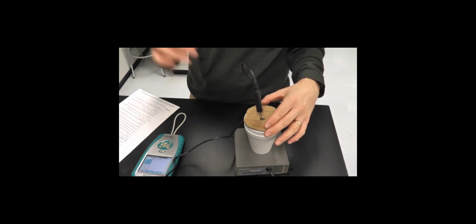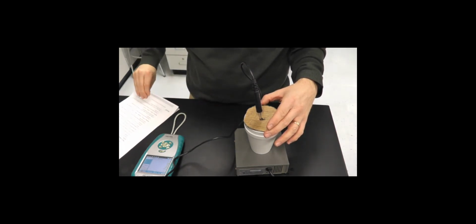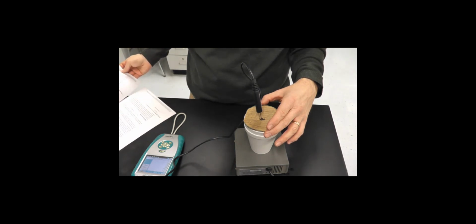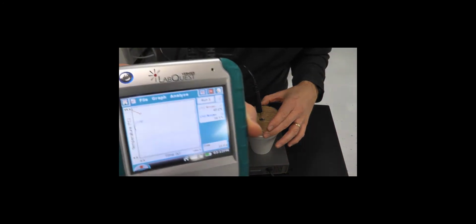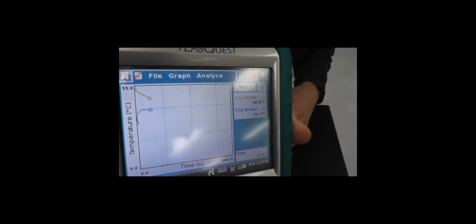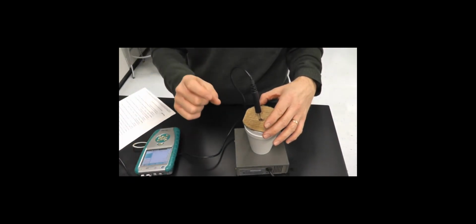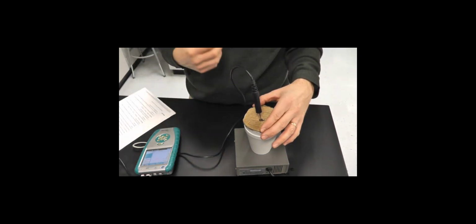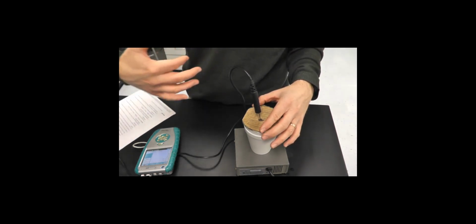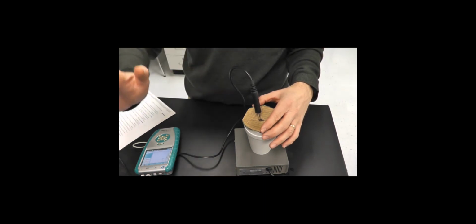I have the lid on the top to try to keep as much heat as possible in my calorimeter. Essentially this first step is to determine the heat capacity of the calorimeter. If you look at the graph, it's not a surprise: the cold water is getting warmer, the hot water is getting colder, and if we have 50 milliliters of both of them, the temperature should equalize exactly. Because we have the same mass of water, everything the hot water is giving up, the cold water is absorbing, should be a wash, essentially.